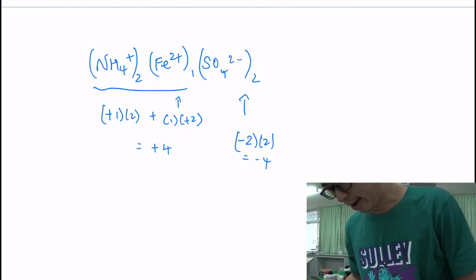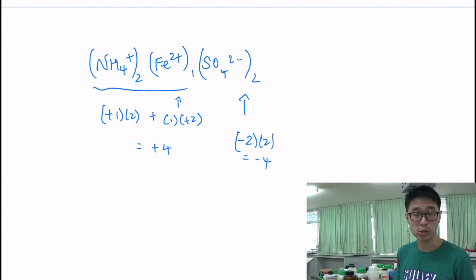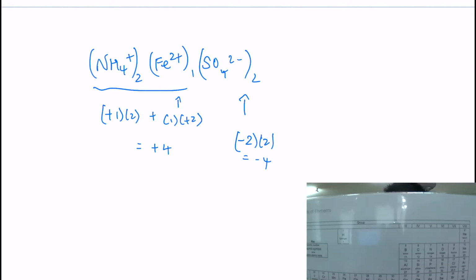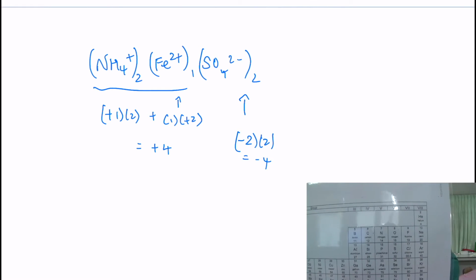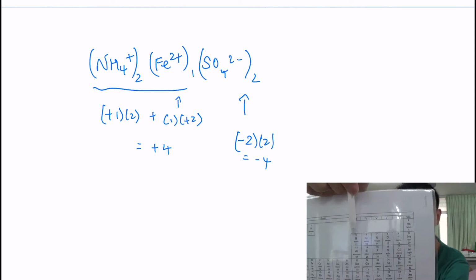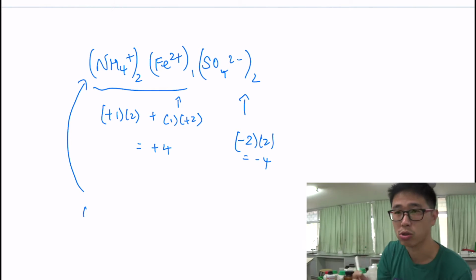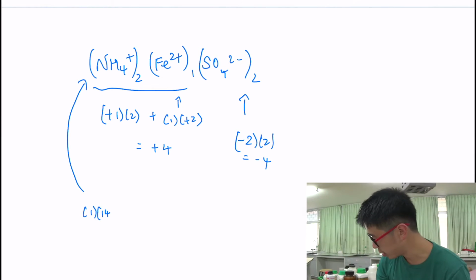So this is the lab that I used to teach in my current school. My current level of teaching is O level. So these are the periodic tables that are a bit primitive. They use the relative atomic mass only to the nearest whole number.